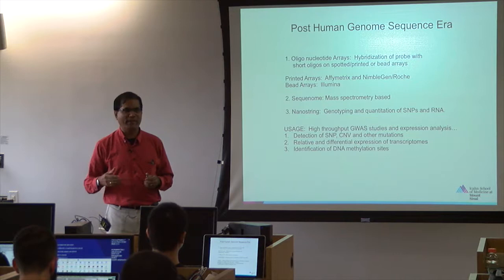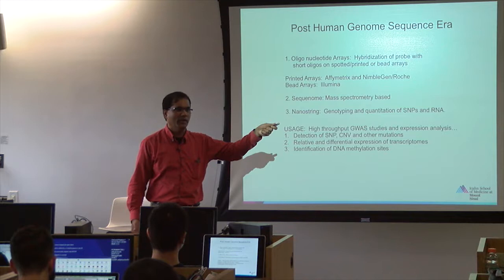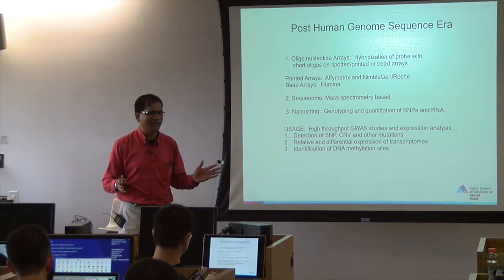And then investigate the other genomes. Because if I have that reference genome spotted as an array, then I can use the other genomes. This is called a control normal genome, and then you can use test genomes against that printed array and study the other genomes. Very simple, right? We don't have to sequence another human genome. Very simple idea, but we have to put that into practice.